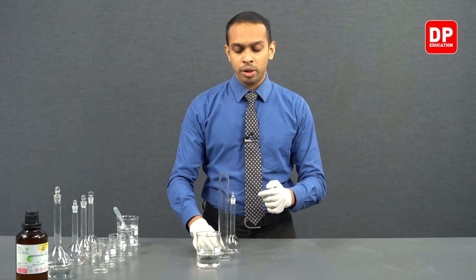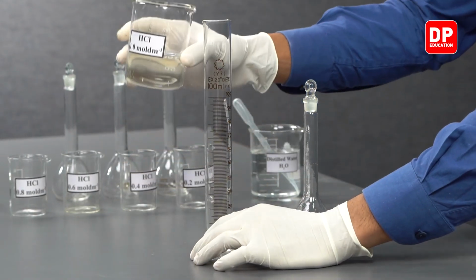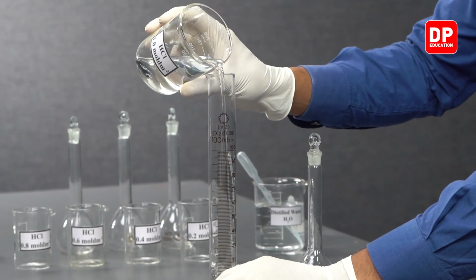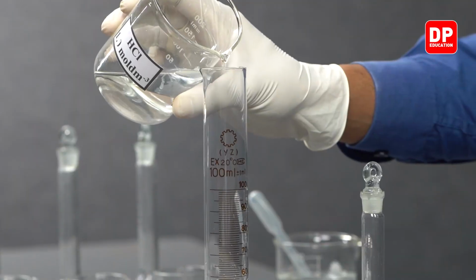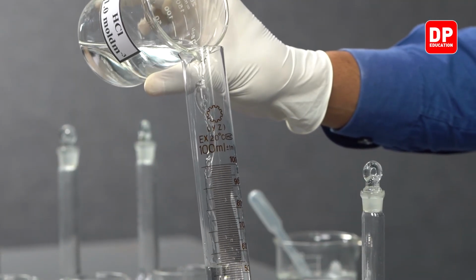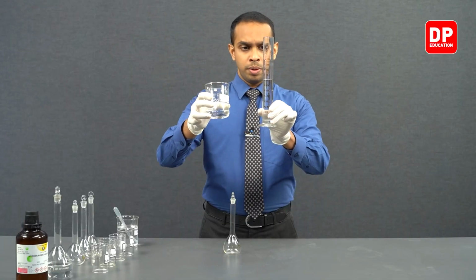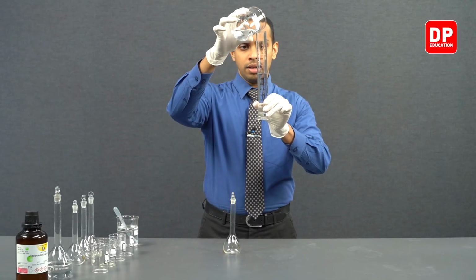So let's go ahead and do that. We have our measuring cylinder here. We can start adding HCl. To make sure that you take the right amount of HCl, you can lift it up to your eye level.